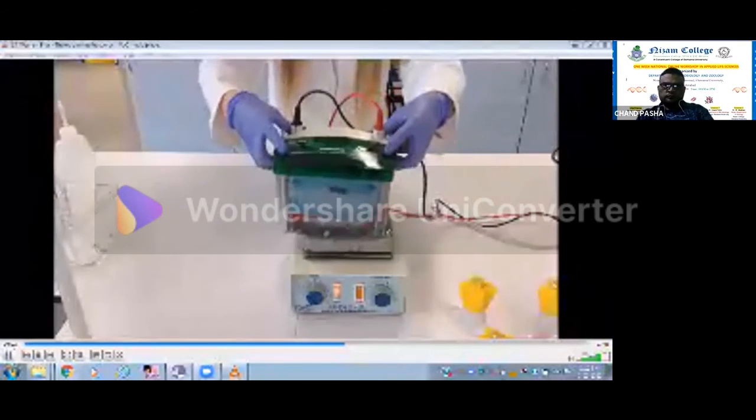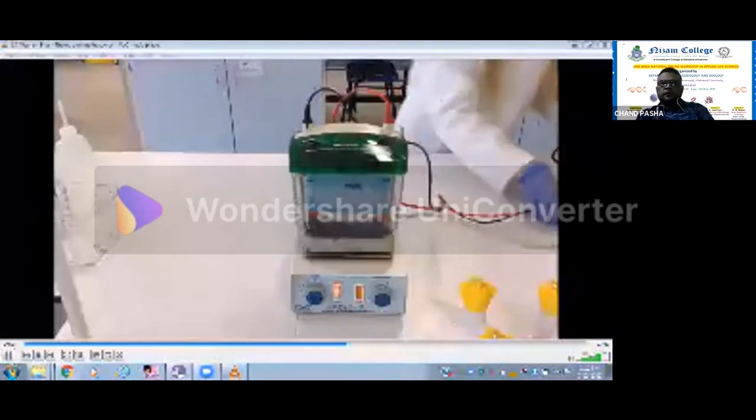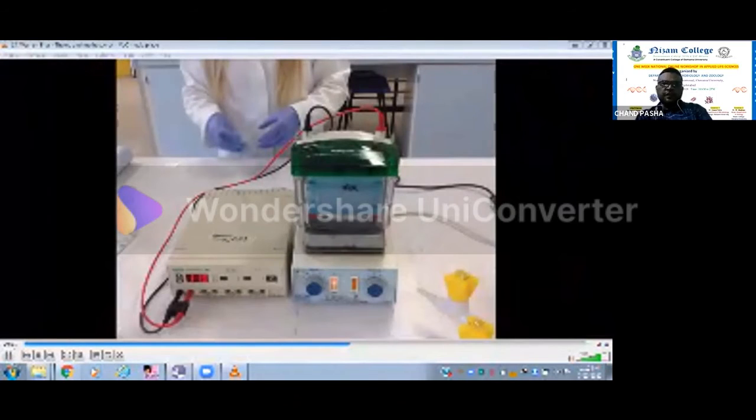You can then place the whole module onto the magnetic stirrer until the transfer process is complete. This magnetic stirrer will also help in maintaining the temperature. Power setting wise, the transfer process will occur at 115 volts.